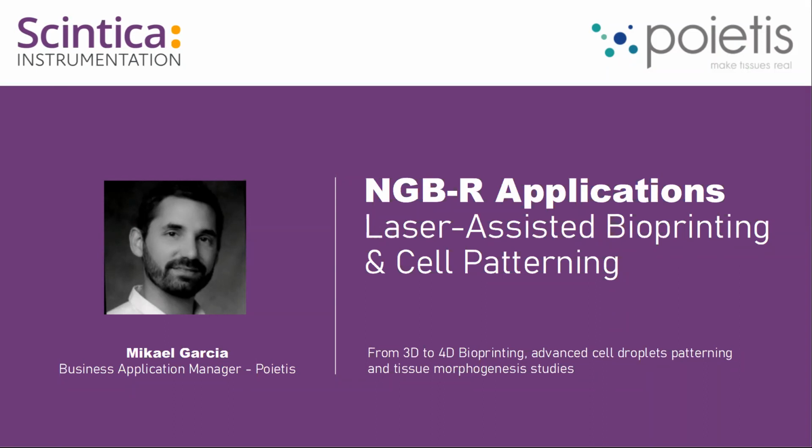In the previous webinar, I discussed the notion of 4D bioprinting and the importance of cellular organization through patterns when designing tissue models. Today, I would like to go into more details and show you the direct applications that laser technology allows.